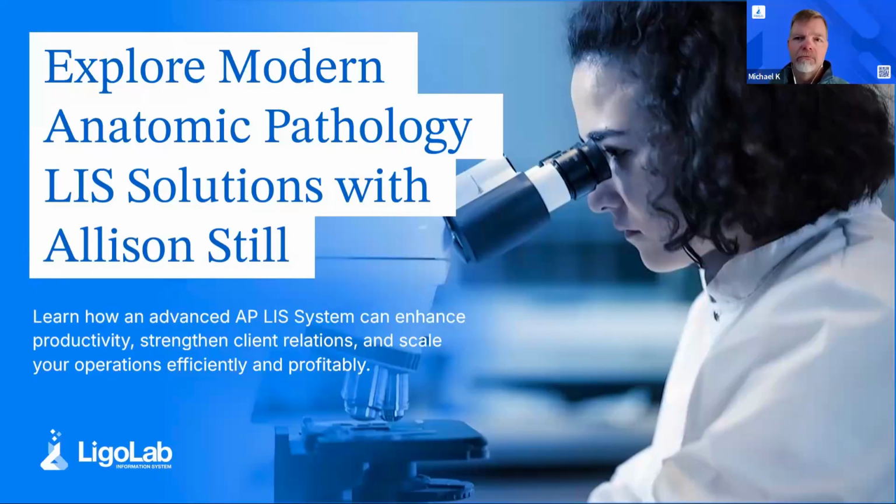Allison, please feel free to fill us in a little bit about you and your role with the company. Allison Still. I've been with the company for a few years now, but before that, I actually worked for a laboratory that used the LigoLab LIS. So it's nice to have that kind of background knowledge. Currently, I am the LIS product manager here at LigoLab, where I help determine what features the development team should work on next, among other things like doing presentations like this. I'm certainly glad that you are able to do so.